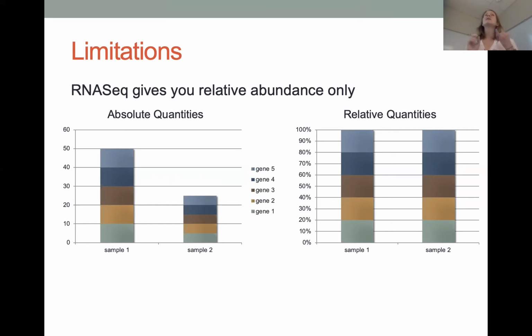That's because transcripts have different biases, like some don't prime as easily as others. That could be random hexamer binding that isn't really that random. PCR has biases. A lot of that comes from the multi-mapping read problem. Some genes have regions where reads just aren't ever going to be counted because they're similar to regions of other genes. So it's really hard to say whether the absolute expression of this gene is similar to that of another gene. Well, one has multi-mapping reads that are getting tossed out and one doesn't.